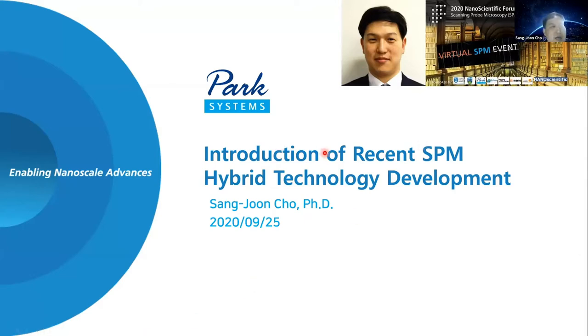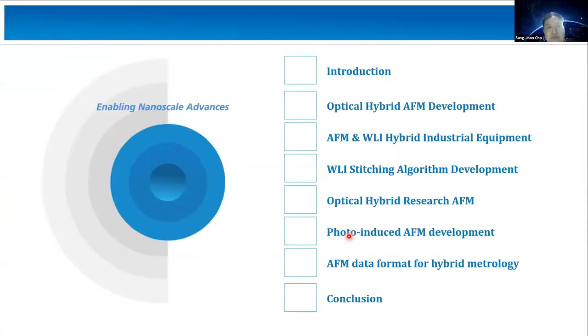And I'm very happy to introduce the recent SPM hybrid technology development at Park Systems, especially in this important section of correlative microscopy techniques for comprehensive material characterization. During the talk, I will introduce several prototypes, alpha and beta hybrid equipment, which are still under development.